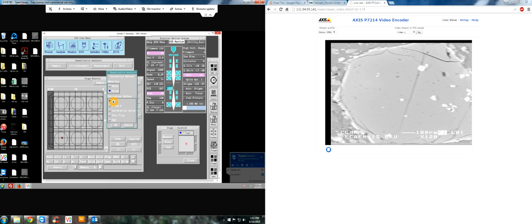which might lead to discrepancies in your data. And finally, F is for fluorescence, so some materials emit secondary X-rays related to primary X-rays as they pass through them. These are correction factors that change as you collect your data. You multiply them by these correction factors and it gives you better results. So just make sure those two are selected and go back to measurement.